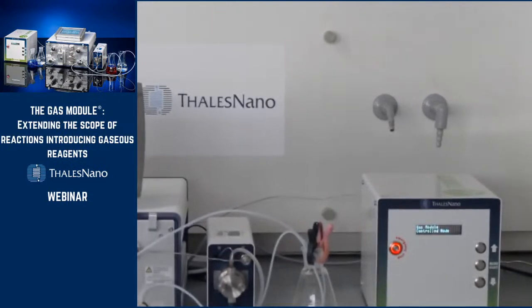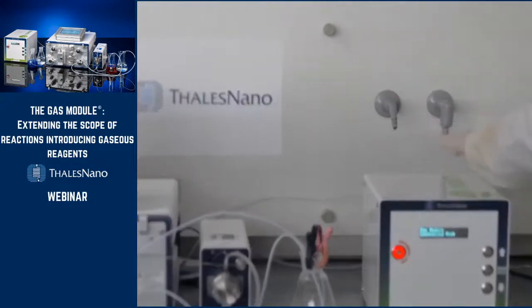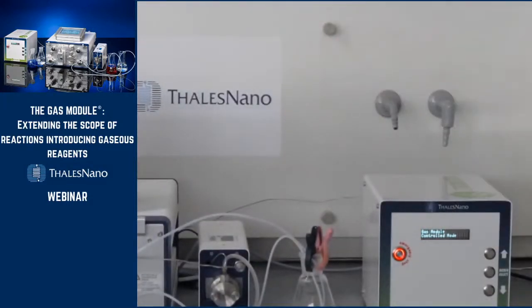there's the control mode. That means it's connected to the H2 Pro because I connected it with a CAN cable that is passing behind. And this cable allows it to be controlled only from the interface of the H-Pro.